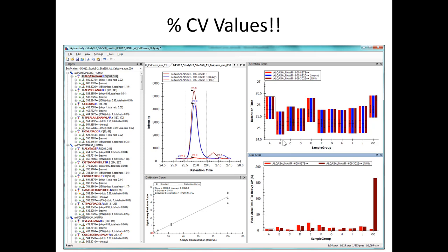Then what's the nice thing about Skyline, I don't know if anyone was aware of this yet. If you right click in here, you can copy this figure into PowerPoint or Excel or Word. Or if you right click and copy data, let's just say for some weird reason you don't like these colors, or you want these samples sorted in a different order, it does this alphanumerically.